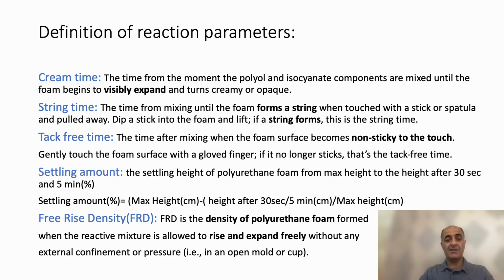The next time is the tack-free time. The tack-free time is the time after mixing when the foam surface becomes non-sticky to the touch. Gently touch the foam surface with a gloved finger. If it no longer sticks, that's the tack-free time. These 3 times are very important in designing a proper polyurethane foam system.